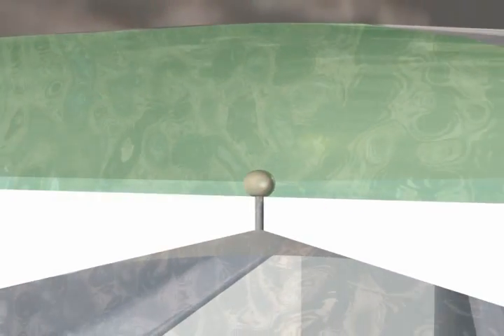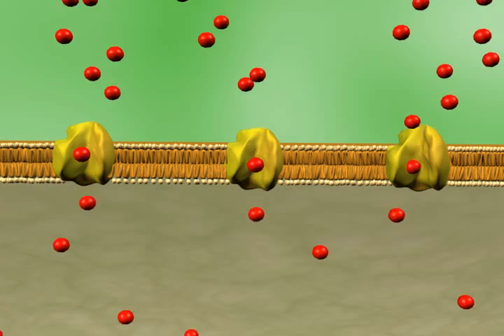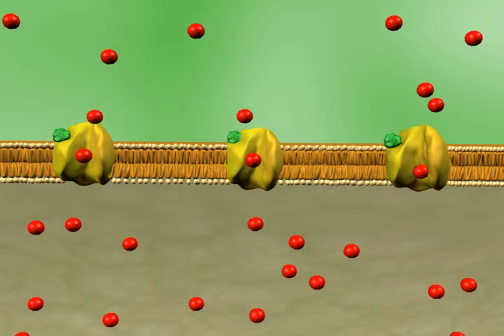Zooming into the level of the ion channel proteins in the plasma membrane shows how the test compounds can bind to the channels and inhibit the flow of ions.